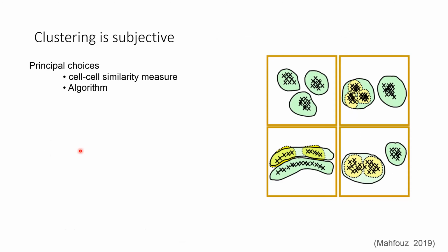Okay, so ultimately the takeaway message from this is that clustering is subjective. First of all, no perfect measurement of all state variables of a cell, as well as their future trajectories, exists, so we can't perfectly map partitions in gene expression space to cell physiology. And second, biologists have to make decisions about what's most important to pay attention to, which is often founded in the history of the tradition.